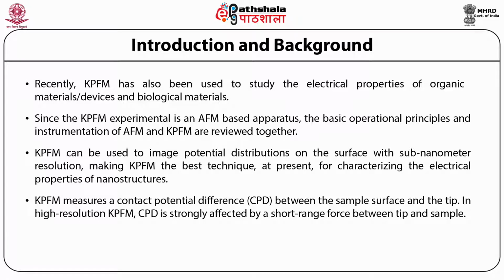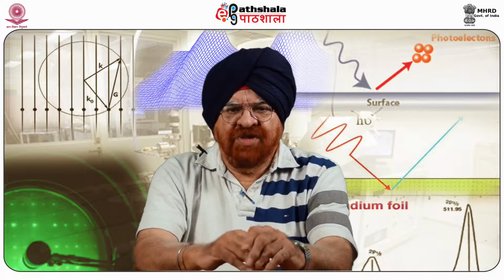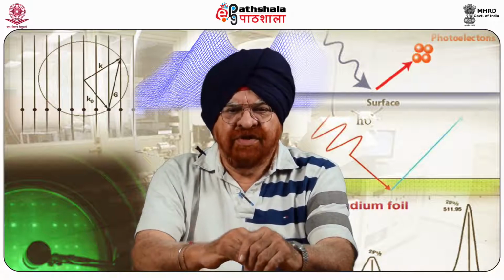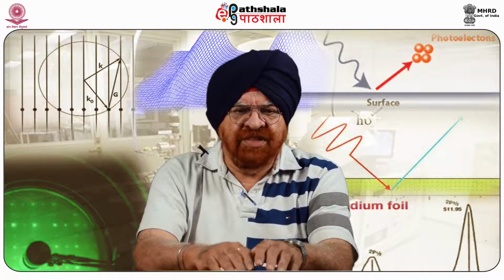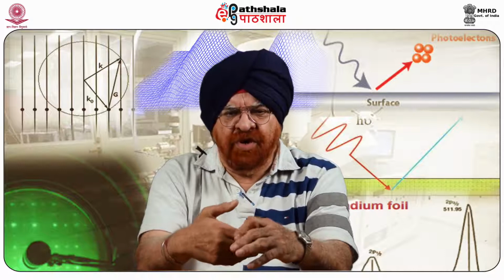In high resolution KPFM, CPD is strongly affected by a short range force between tip and sample. The CPD associated with the short range force is specifically referred to as the local contact potential difference, abbreviated as LCPD. For high resolution KPFM, understanding the fundamental difference between the CPD and the LCPD is very critical, or in other words, it's extremely important.